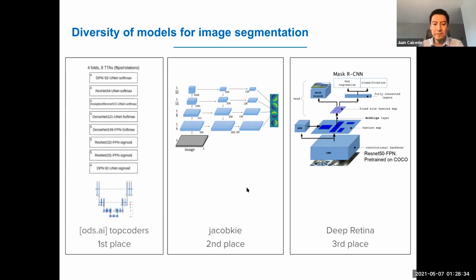And finally, the type of architecture that they used is a classic one. It's called the U-Net. Maybe you have seen it in other works. The basic idea here is that you take the image and you compute representations all the way down to a lower resolution or even a single feature vector. And then from there, you decode that representation back into a full resolution image.